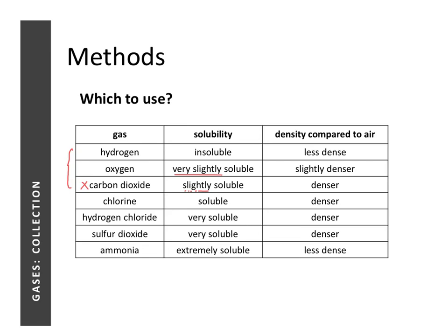Next, the 4 bottom gases cannot be collected using displacement of water. Why? Because they will dissolve in water. So we can either collect them using downward or upward delivery. From the density, you can see that the first 3 of the lot, we need to use downward delivery, and then the last one, ammonia, we have to use upward delivery.